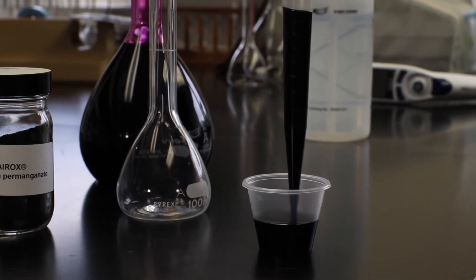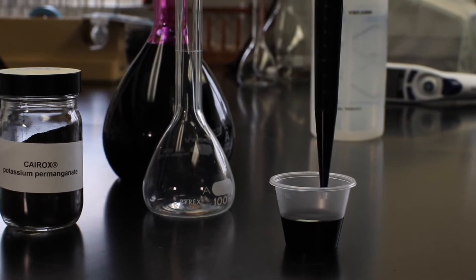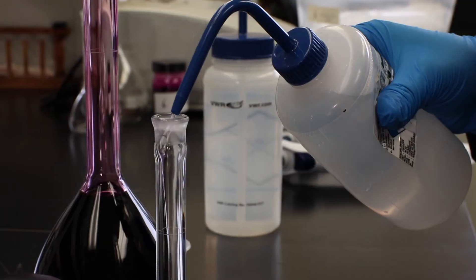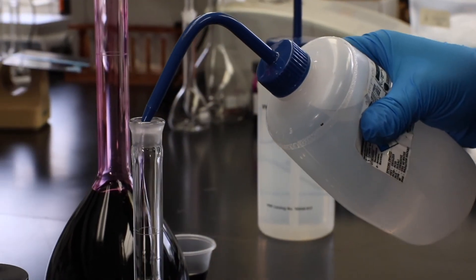Pipette 10 milliliters of the 1% potassium permanganate stock solution into a 100 milliliter volumetric flask and dilute with distilled water to 100 milliliters.